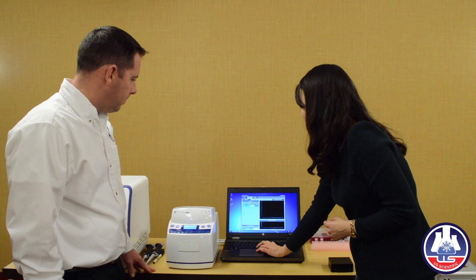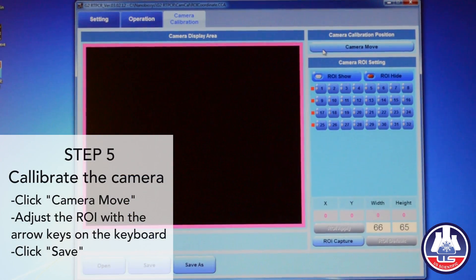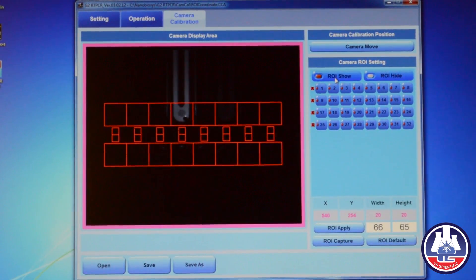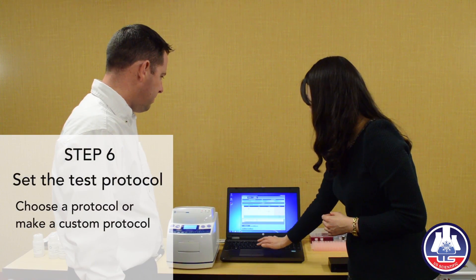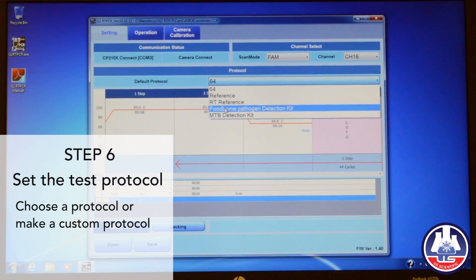Now it's time to go to the camera calibration tab. Click the camera move button. Now you can see the inside of the channel. Click the ROI button and make sure every ROI position is correct with the channel — you can control the ROI with the keyboard. Then click save, and make sure you have your test protocol or you can make your own protocol.